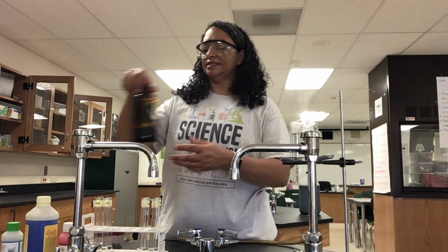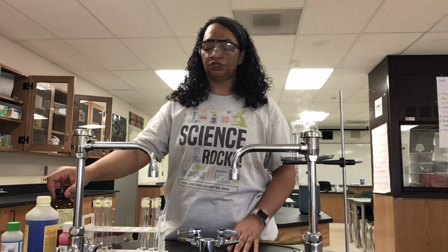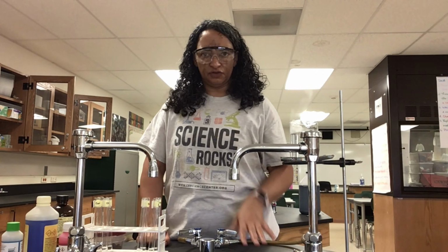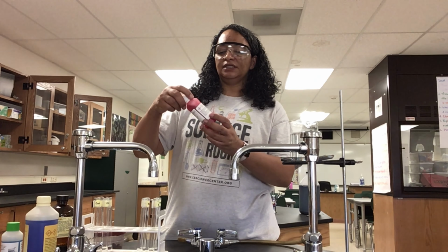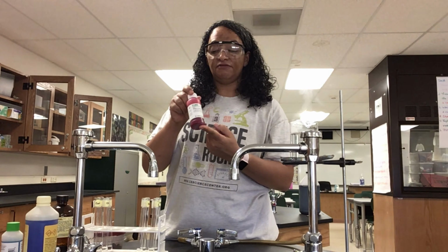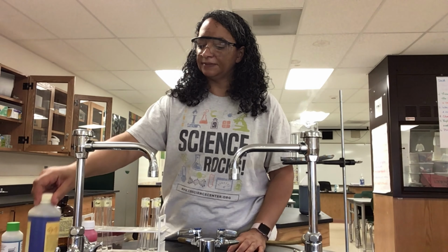The first one is basically just iodine. Iodine tests for the presence of starch. So if starch is present, then the iodine will turn a really dark black. So you can put it like on a potato, which is full of starch, and it'll turn totally black. The second indicator we're using today is called Sudan IV, and this tests for the presence of fats, and it will actually kind of clump up at the top if there are fats present.